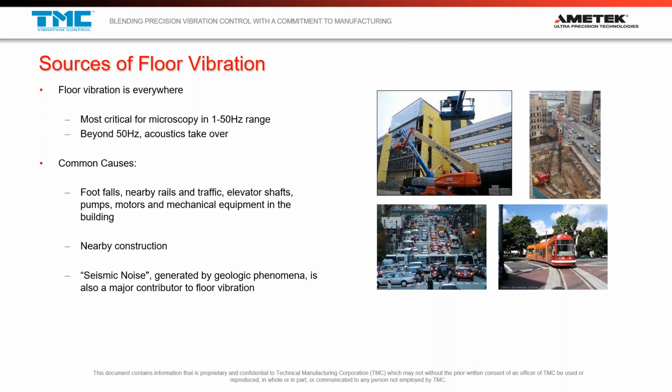And what's so interesting about advanced microscopy is the places where they tend to do advanced microscopy tend to be very noisy places. So you have universities in town centers and city centers where you have lots of noise from traffic and from people walking around in the building. You have elevator shafts going up and down the building, which vibrate the building. There are pumps and motors and HVAC systems. There's construction nearby. We even see things called seismic noise, not seismic noise like earthquakes, which are a whole completely separate problem for advanced microscopy.